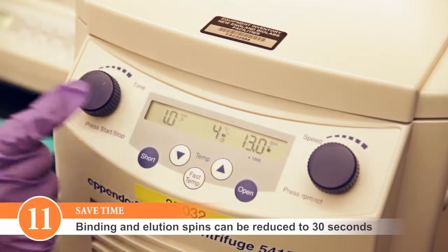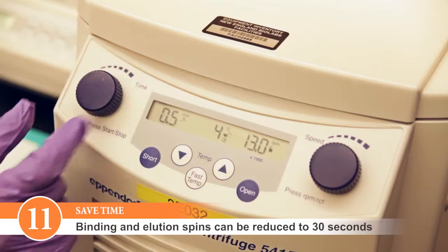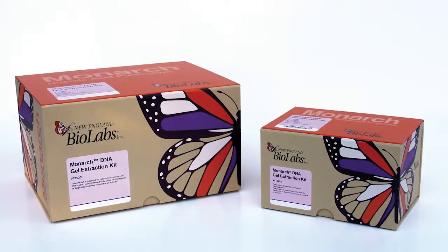To save time, the binding and elution spin steps can be reduced to 30 seconds.